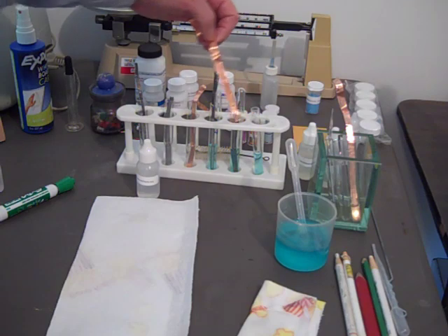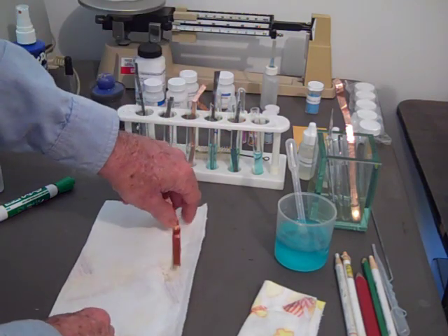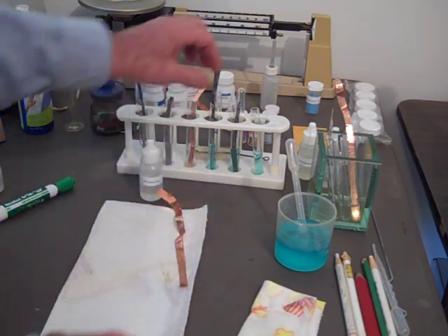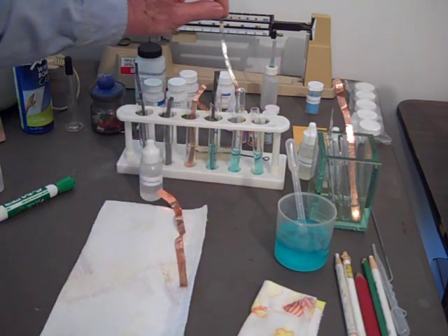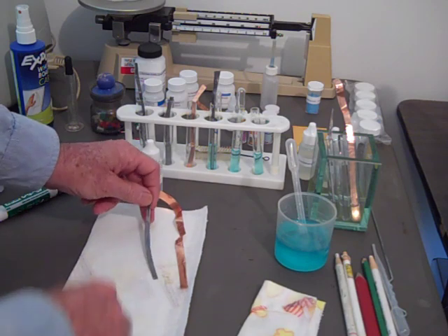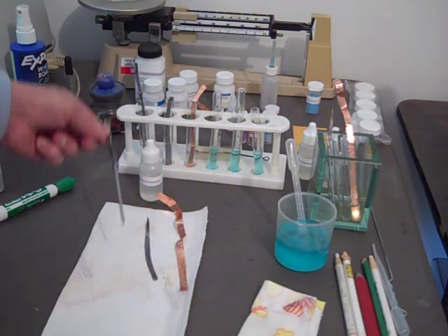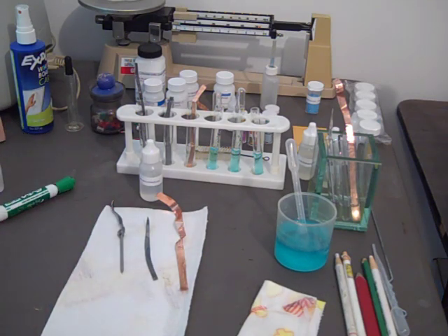Here's a piece of copper. Nothing has happened to the copper at first glance. Here's the lead. You can see the lead is really brown and darkened quite a bit. And here's the galvanized nail. And I actually don't see much change in that.